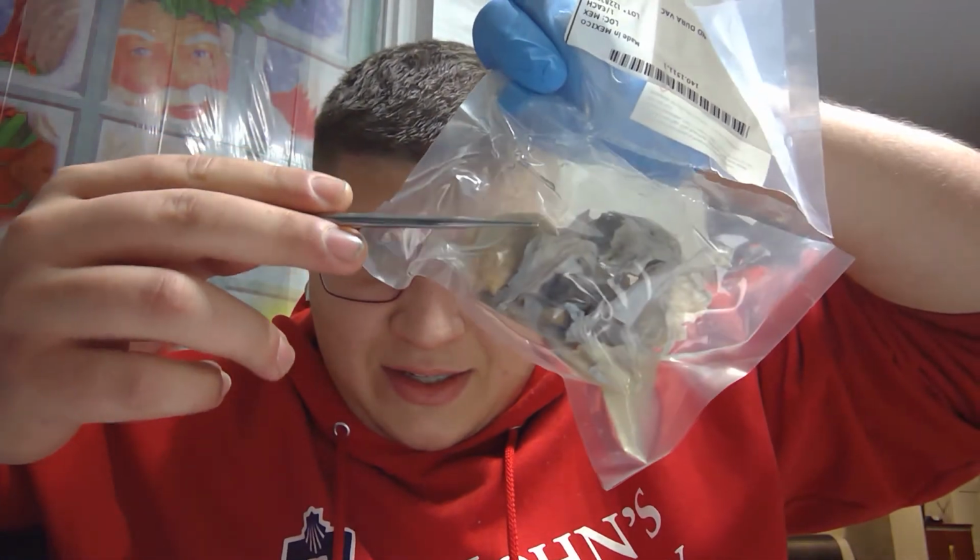And the final part is the meninges. Meninges is actually the first part that you have to remove. It's these gray skin-like fibers that overlap around the brain.